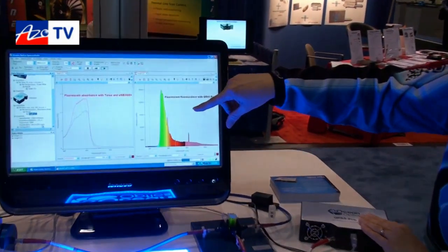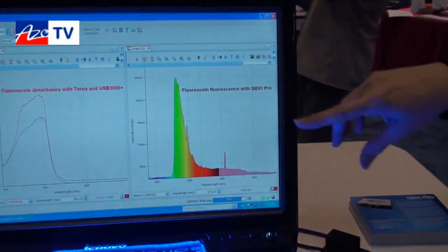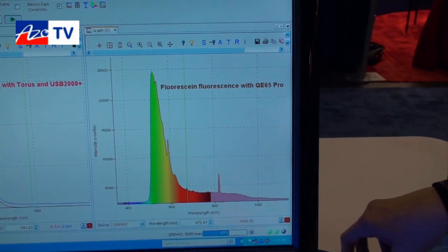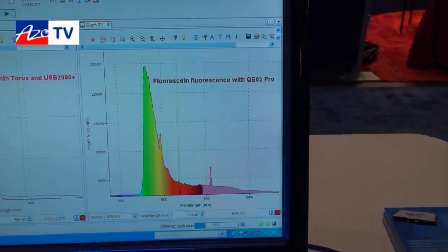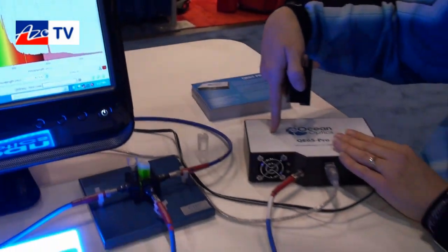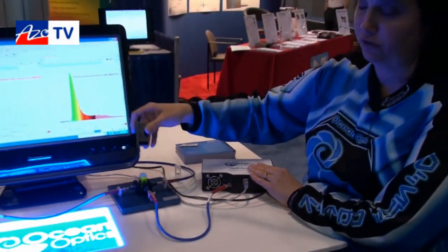What you see here is the fluorescence spectrum we're looking at. What's nice is with the thermoelectric cooler on this spectrometer, you can go to very long integration times and see very low levels of fluorescence.